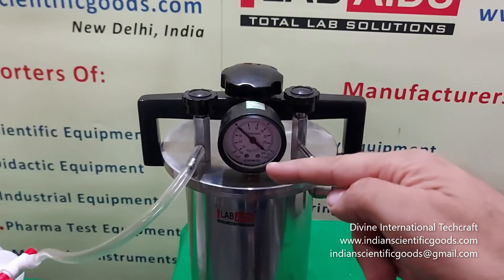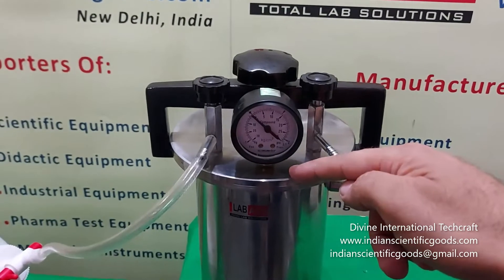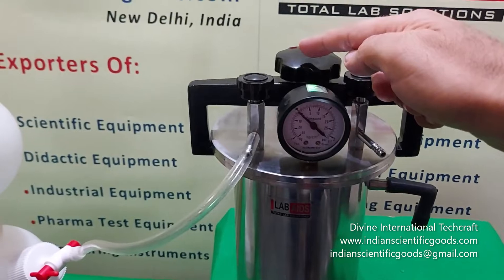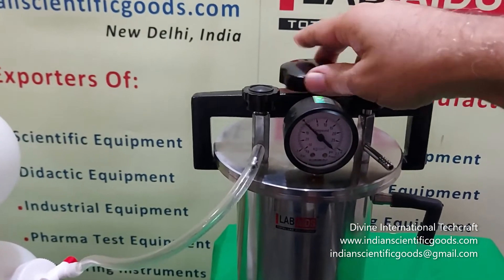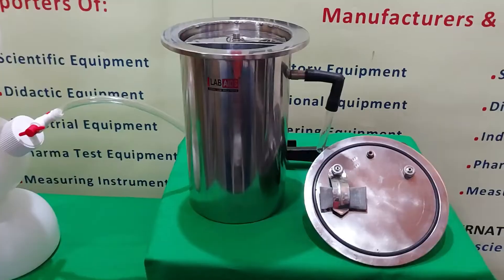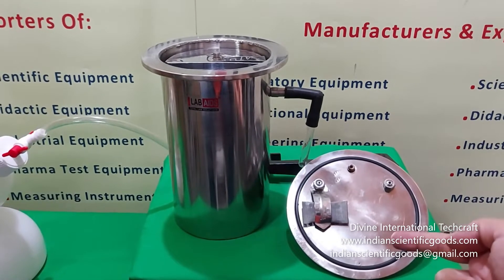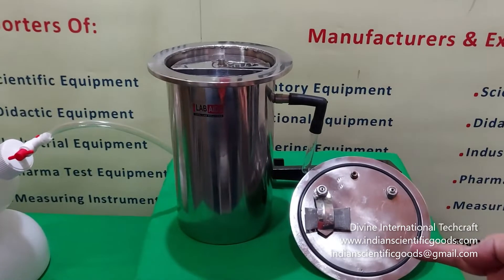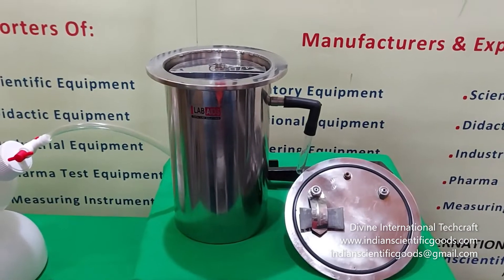The lid is held tightly to the jar using a strong bridge clamp with a tightening screw. To open the lid we simply unscrew the bridge clamp. Inside the lid a rubber O-ring is provided. It eliminates the need of grease and plasticine and provides a perfect seal with hand tightness.